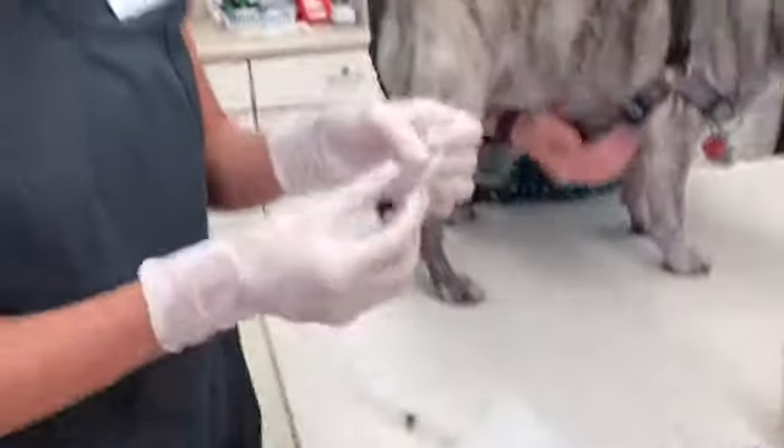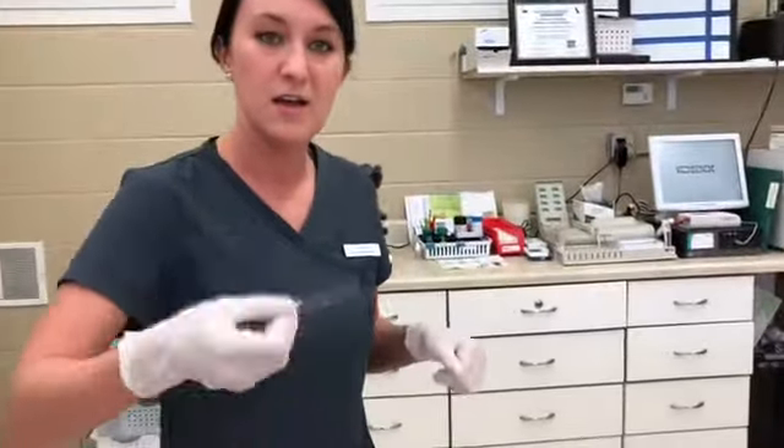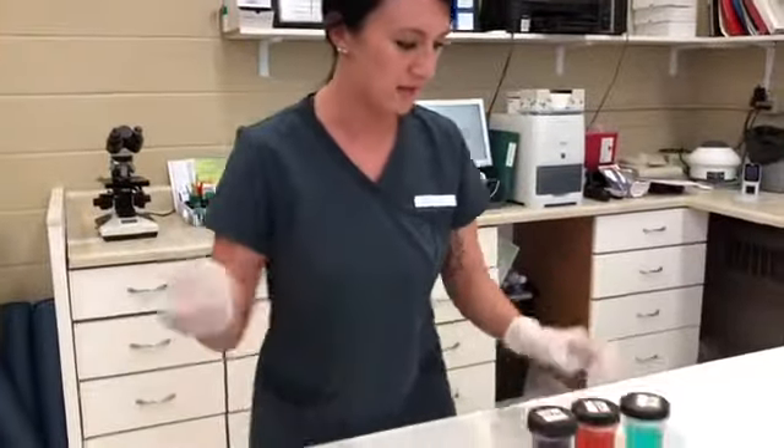Perfect, you can kind of see the sample there. I'm just going to dry it by gently waving it in the air. While I'm doing that, I'll get my Diff-Quick ready.